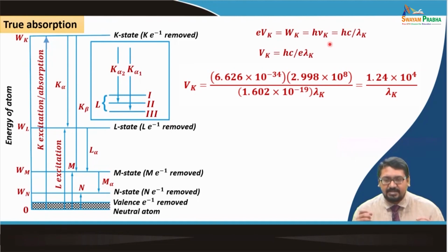The electrons from the cathode hit the anode, and in this case the anode is the copper anode, right. And as the energy of these electrons increases, we have to increase the voltage to increase the energy of the electron, so that the electrons hitting the anode can produce more and more intense X-rays. So, Wk is related to electron volt, right.